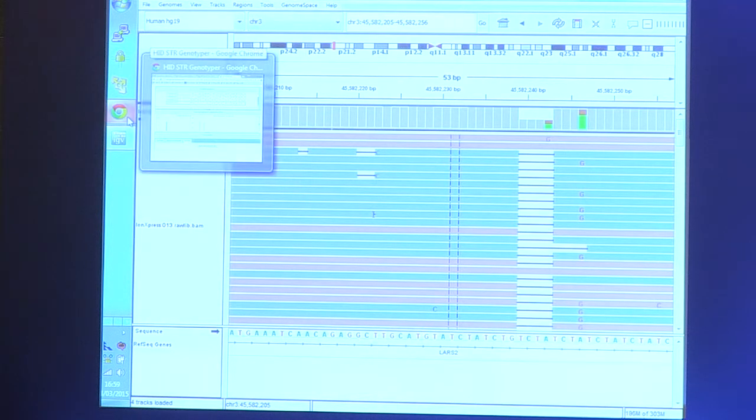Okay, and with that then, we've had a trip through what data looks like coming off the PGM from the run report and then into the sequence-specific and application-specific analysis that you can make later. Okay, so with that, I'm finished, and thank you. So back to you, Philip.